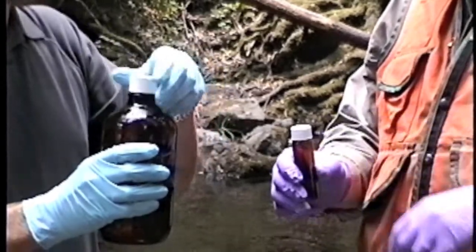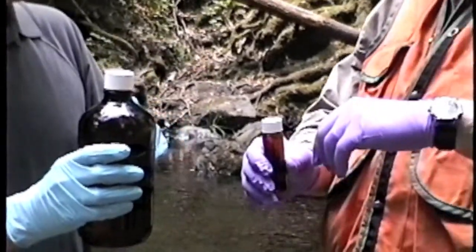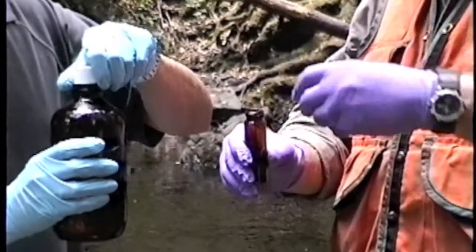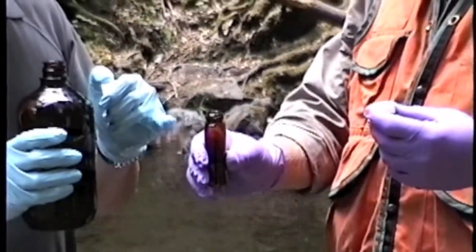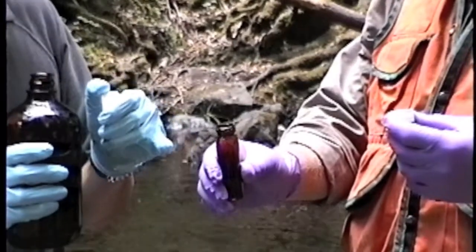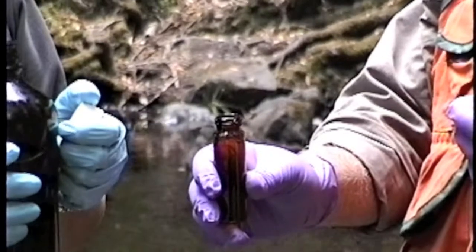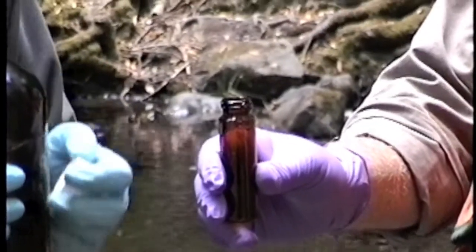You want to make sure that you fill the bottle with no headspace before pouring into the VOC vial. The VOC vial has a 0.5% hydrochloric acid solution preservative, just to make sure that the sample is preserved due to the short holding time.